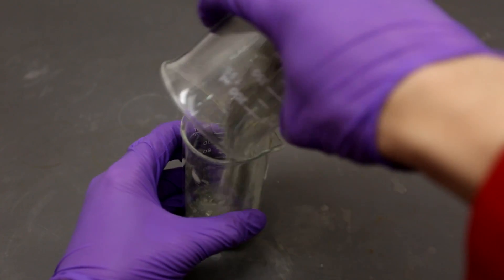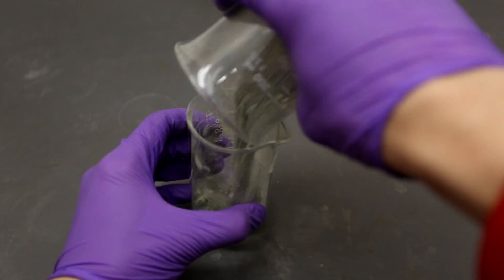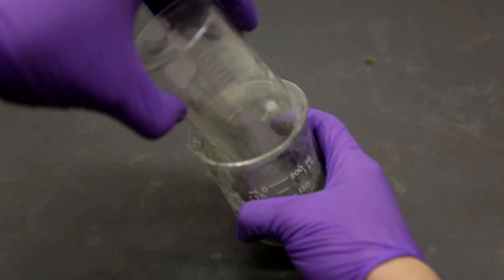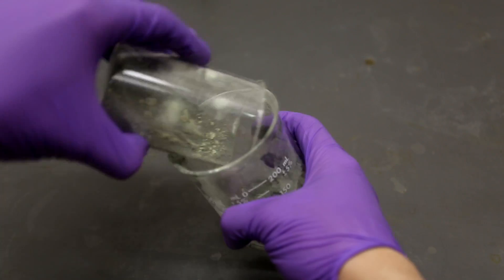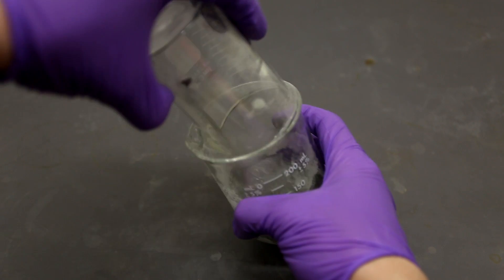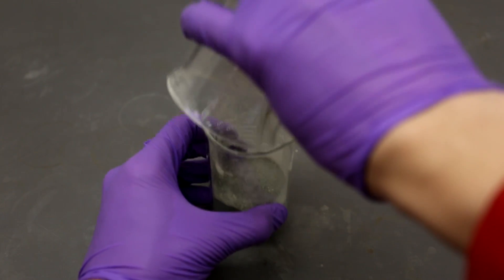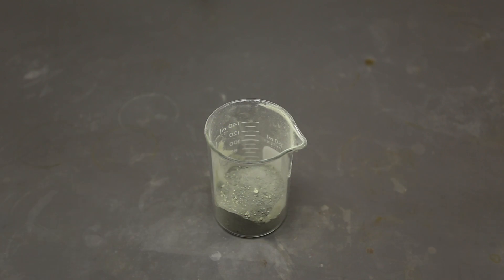Now that we are done mixing the powders, we are ready to react them. The best and most impressive way to set off the reaction is to simply heat up a glass rod and place it into the powder. The temperature of the glass stirring rod only has to be a little over 100 degrees, which is the melting point of sulfur. When the sulfur melts, its reaction with iron will begin.